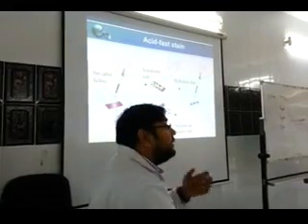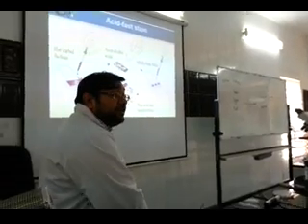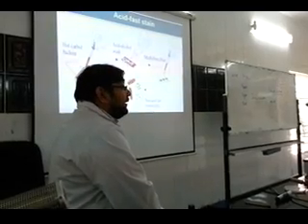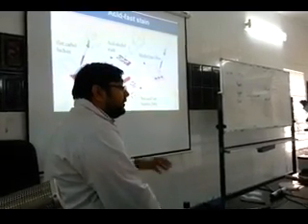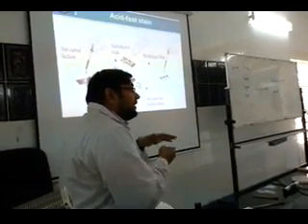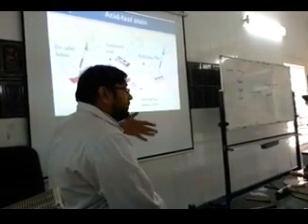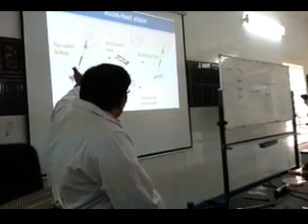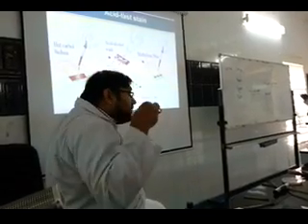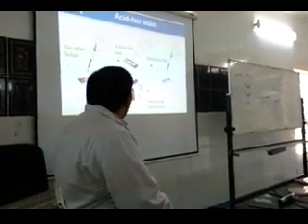Okay. So, we are about to finish. The presentation, okay, not the practical. In this stain, we have to get the dye inside the cell, inside the bacterial cell, not only the cell wall. So what we do, after making a smear first, we put hot carbol fuchsin, this is a red color dye, and heat. When we are heating from the bottom, it breaks the cells and goes inside. All become red.